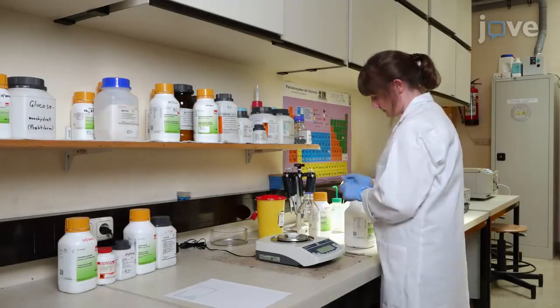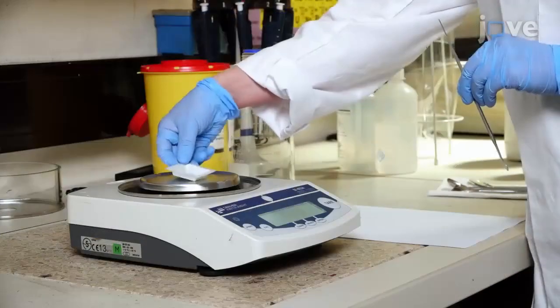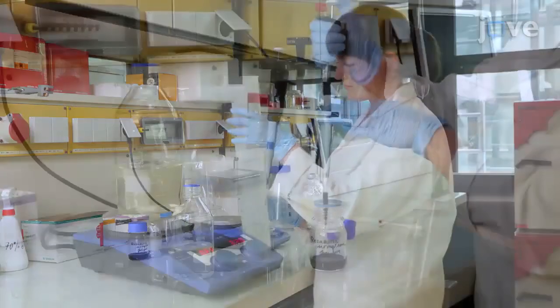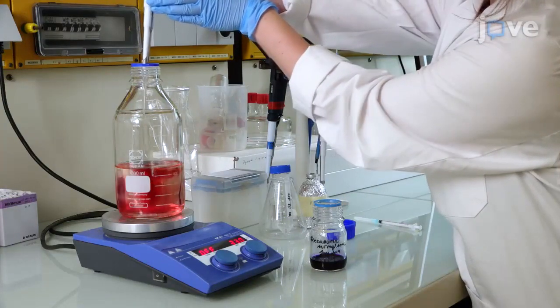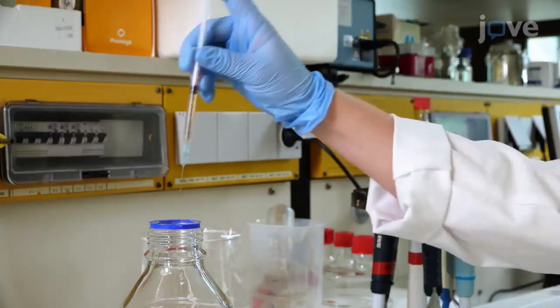Start by weighing medium ingredients in an appropriate flask and dissolving them with half volume of distilled water. Then add 1 milliliter of redox indicator, followed by vitamins and trace element solution.